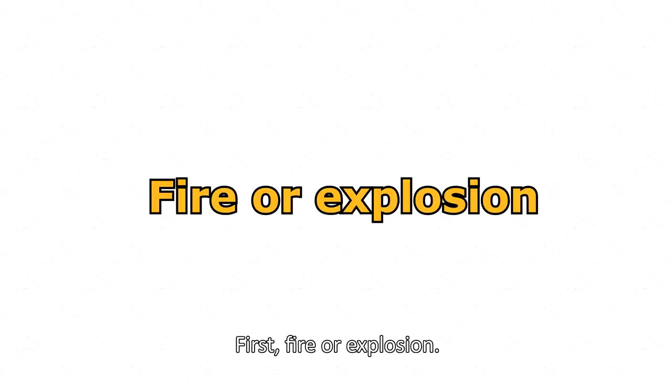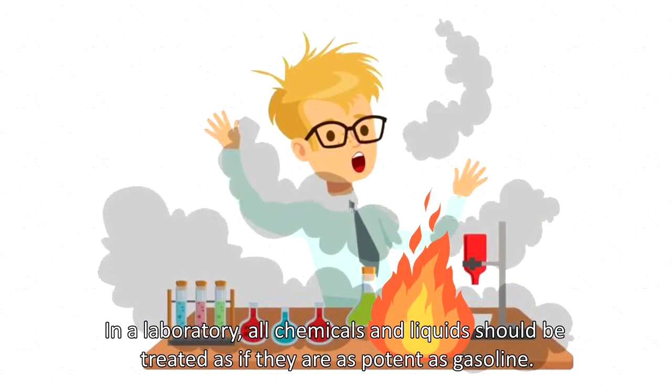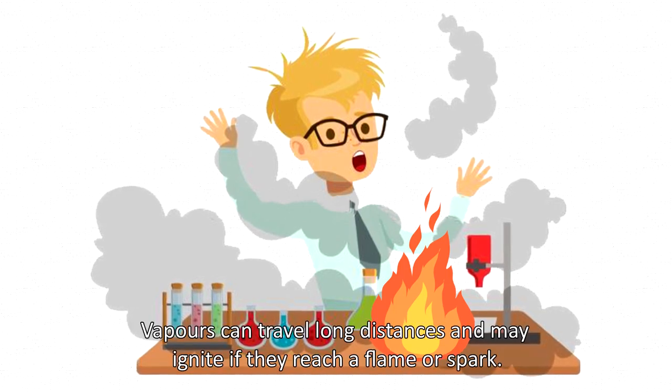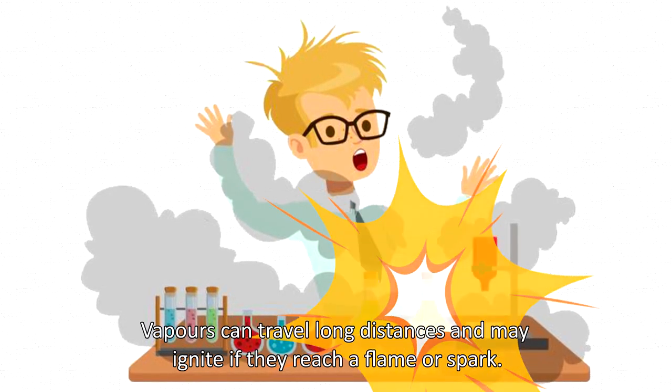Next, we move on to potential hazards in a laboratory. First, fire or explosions. In a laboratory, all chemicals and liquids should be treated as if they are as potent as gasoline. Vapors can travel long distances and may ignite if they reach a flame or spark.